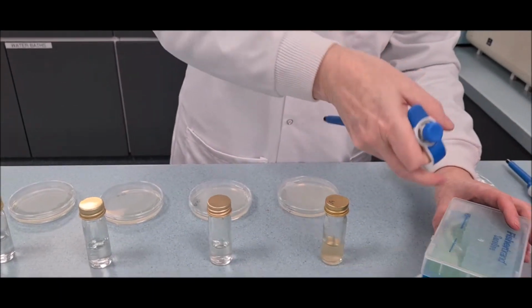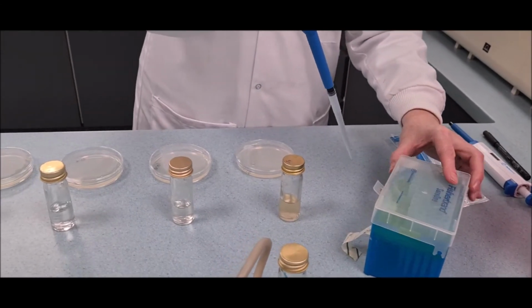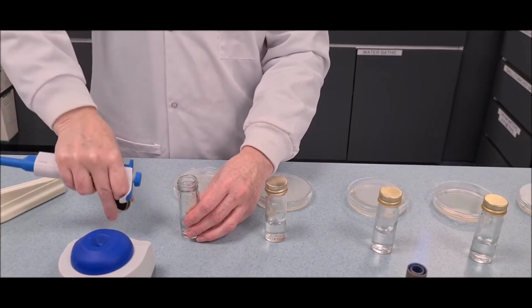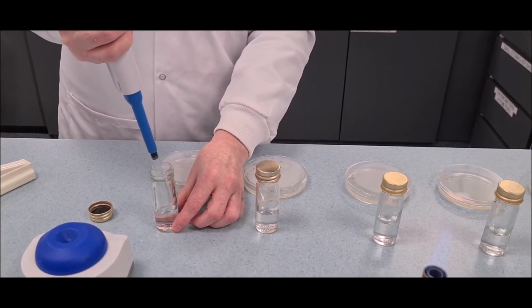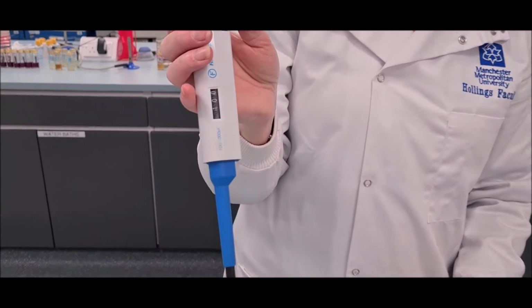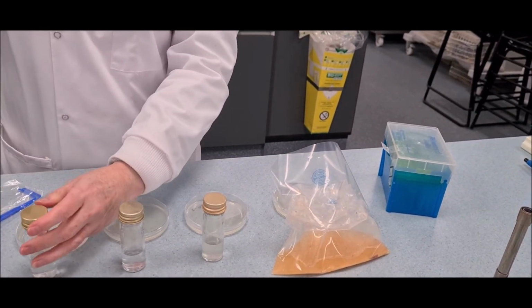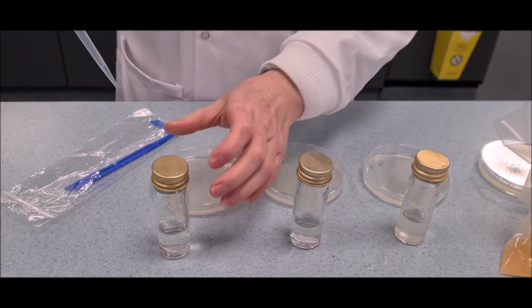In the second option, plating starts from the more diluted sample, in this case 10^-7. For this option, the same pipette tip can be used to transfer the sample from respective dilutions to corresponding agar plates. Similarly, the same spreader can be used for spreading the sample on the agar surface, starting from the more diluted sample. Using the 100 microliter micropipette, aseptically transfer 100 microliter or 0.1 milliliter of respective dilution onto the corresponding agar plate, starting from the highest diluted sample. Do this for all the selective and differential media as well as the non-selective media.